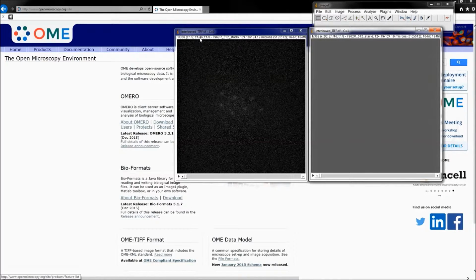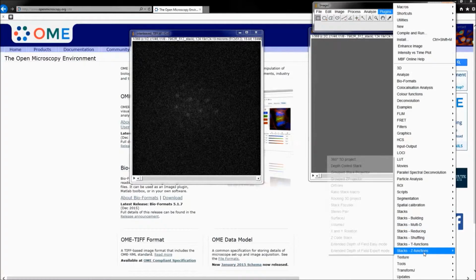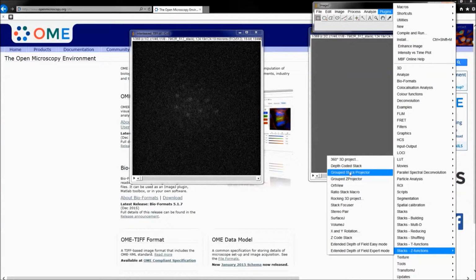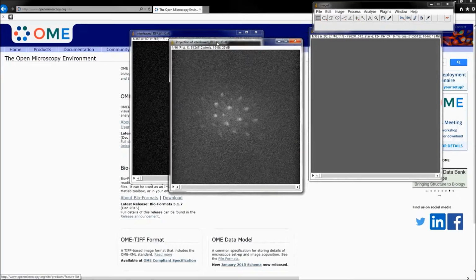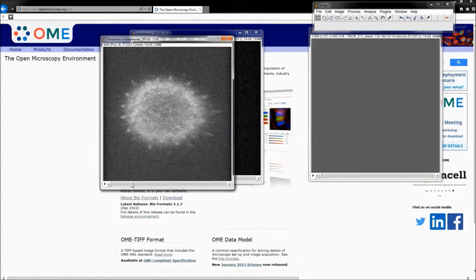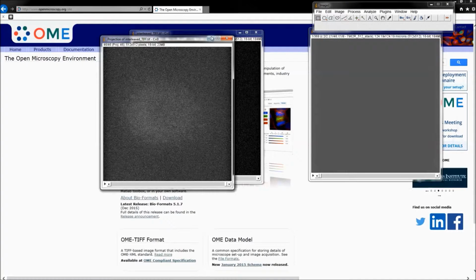It's displaying the number of slices in this Z stack and the number of time slices at each Z plane. That means I can easily go into my plugins menu and run an average for each Z position without having to dig into the metadata and try and figure out how many slices I took per plane. So here is my average stack with all 8 time slices for each Z position averaged together.